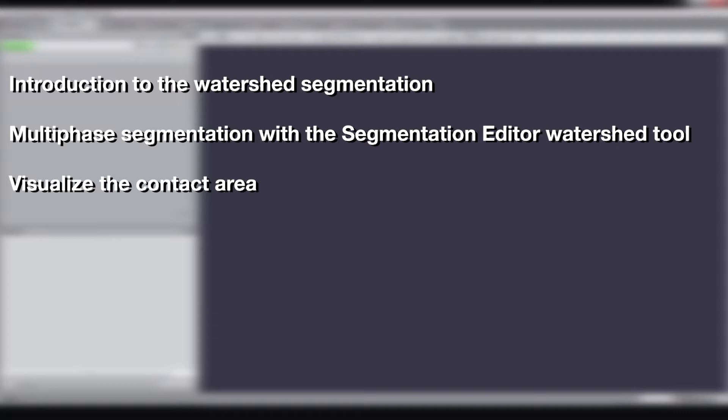You will also learn how to visualize the result and the contact area of the different faces in your data. To follow this tutorial, you should preferably be familiar with the use of the Segmentation Editor. Please refer to our dedicated tutorials on that topic.